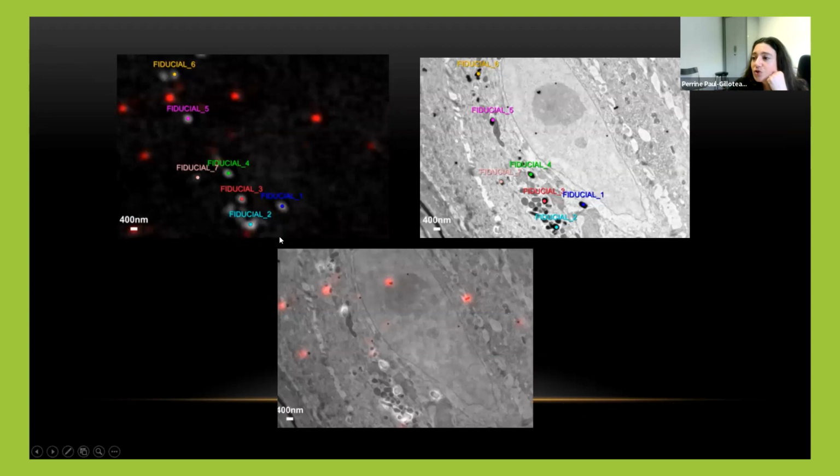And just to show that it's working, so here in 2D, but it's also working in 3D on a simple example. So here you have 2 images, and you have some melanosomes in the image, and you have some bits, which are fluorescent in both images. Normally, you will use these bits to do the correlation.